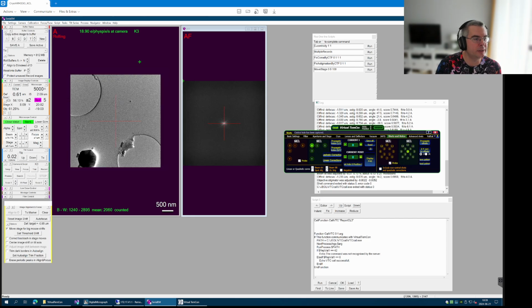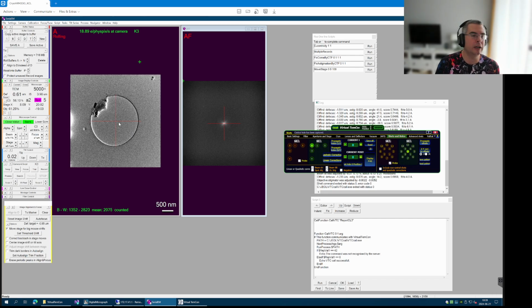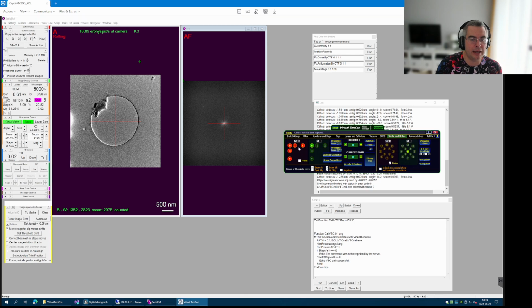Yeah, so we may say that this is going to be my hole number 1. So I just go there with image shift. This is a 2x2 grid. This is why these distances are so huge. Then I get this as hole 1. Okay. Then I set hole 0.